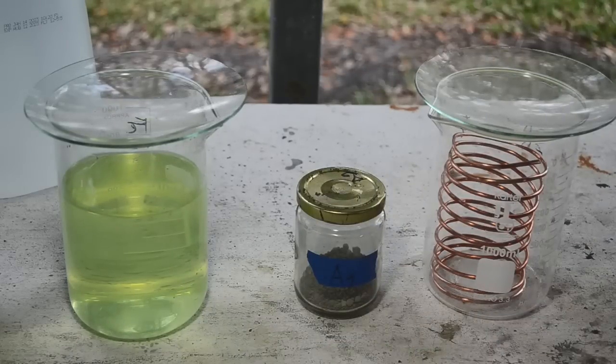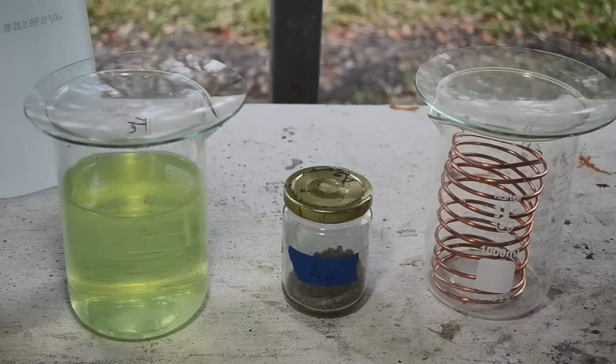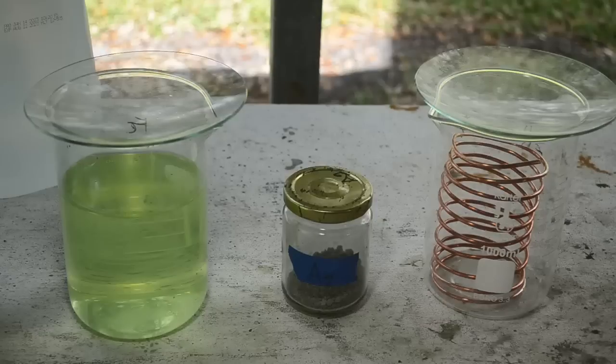So I've mentioned that in conversations with a couple of people, and I think that the silver chloride lye and sugar method gives me much cleaner silver than the copper cementation. They said, of course, well, you're doing it wrong. Okay. They said what you need to do is boil your cement silver in sulfuric acid, and that will get rid of any copper contamination.